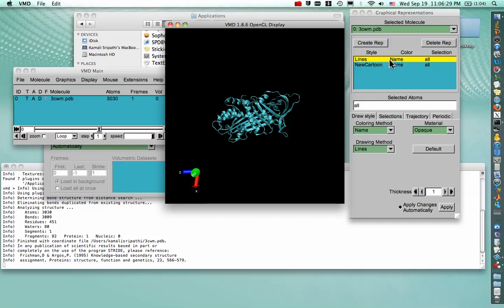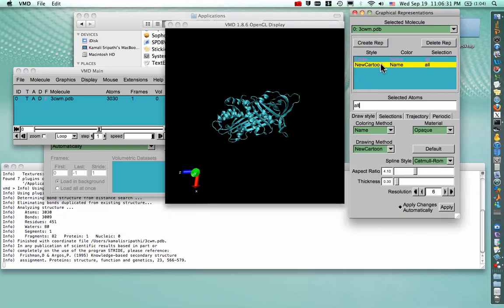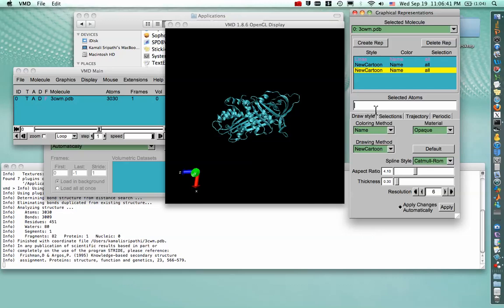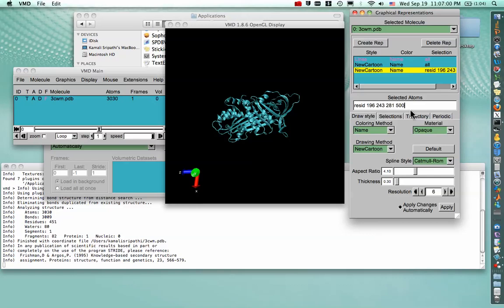And to create a representation of our three favorite residues, we again go to Create Representation. And instead of All, we'll type in the residue numbers by first using the keyword RESID. Then we want residue number 2, 196, 243, 281, and 500 for the citrate molecule. Press Enter to lock that in.